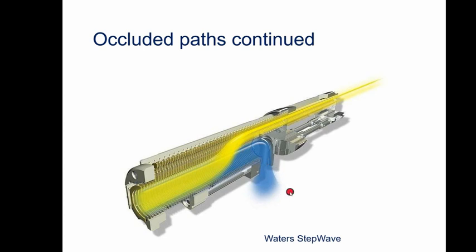And all of these are to try and help keep these parts of the instrument from getting dirty. The performance will inevitably suffer as soon as we start to coat the surfaces of the electrodes further through a mass spectrometer with organic molecules from evaporating solution.